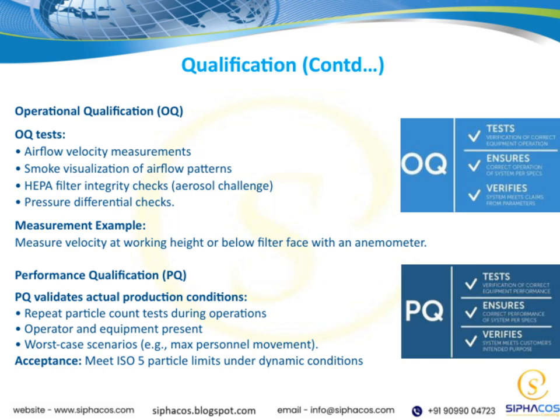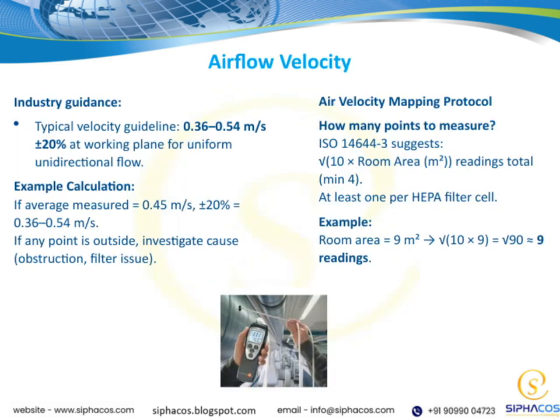Finally, as we continue with qualification, it's vital to remember that these steps are interconnected. They build confidence that the environment is not just theoretically compliant, but practically maintained under normal and challenging conditions. This comprehensive approach helps us ensure the integrity of the clean environment, which is fundamental for quality and safety in our processes.